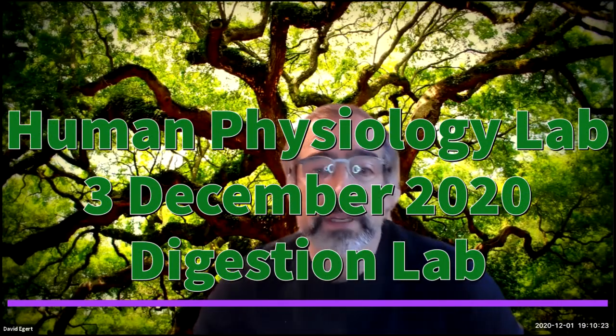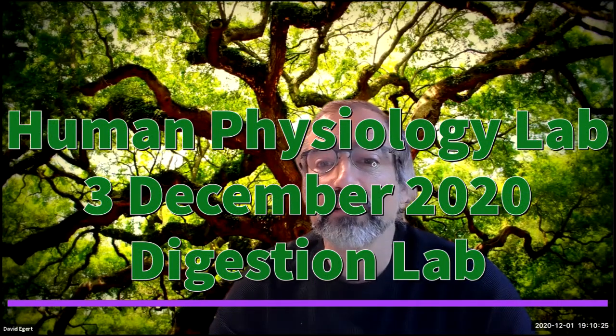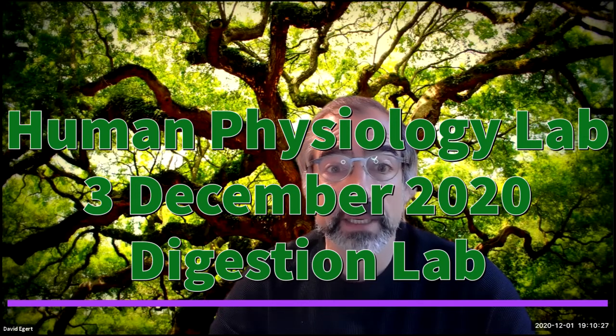So what we're going to do now is our final lab of the semester. It's basically going to be looking at some of these different breakdown processes along the different levels of the digestive path and see how they're affected by different kinds of conditions.